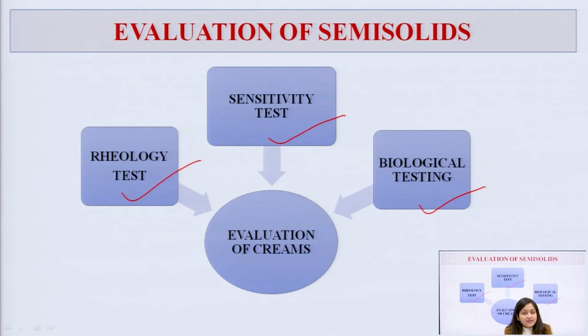The rheology test helps us to understand that if during manufacture the viscosity was a certain amount, let us say 25 centipoises, whether after 2 years of shelf life the viscosity or rheologic properties remain intact or not. So, rheologic testing helps us to identify the viscosity, the flow properties, the thickness and the stability of our formulation.